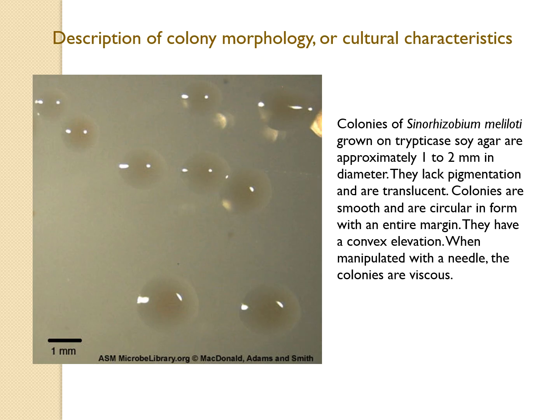So the description of a colony morphology or the cultural characteristics, this is what a microbiologist writes up. So it would give the name of the organism, and it would tell you what agar it was grown on, and it would tell you the size of the colony. So where do they get that size? They use a ruler. They use a little teeny tiny ruler. You actually have one in your microscope, in some microscopes where you can measure things as well.